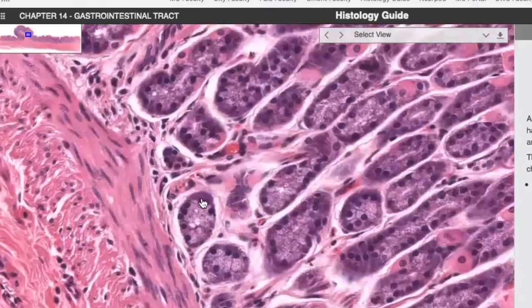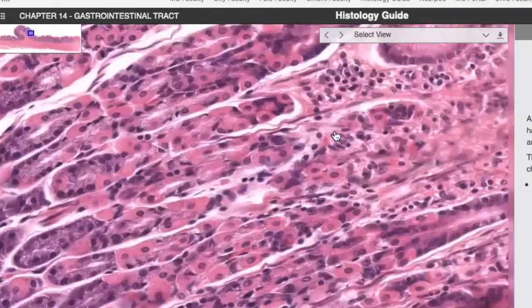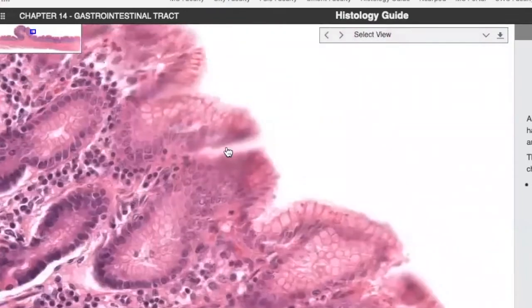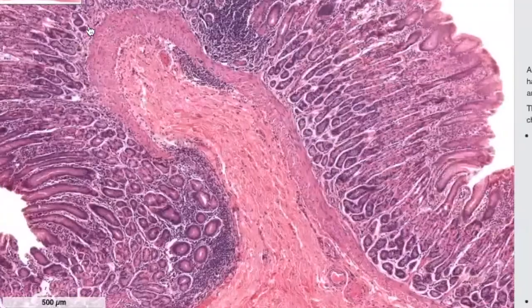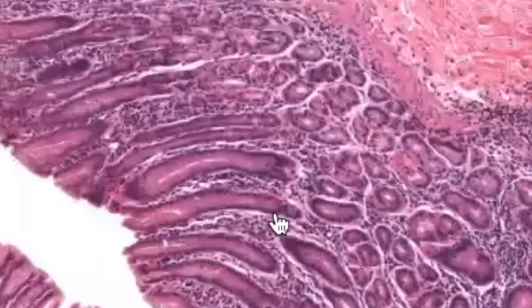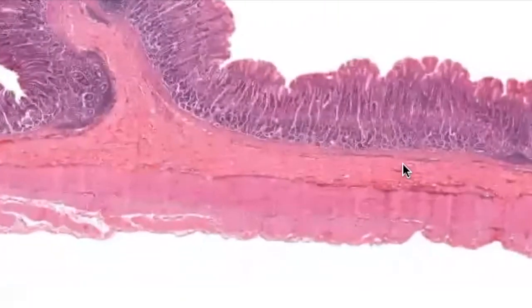And then you get into your mucosal membrane, right? This is the lamina propria, but with all the gastric gland material in it, right? Up at the top, you'd have the gastric pits up there. Okay, so that's the gastric fold over here. These would be like the gastric pits up there on top of that.